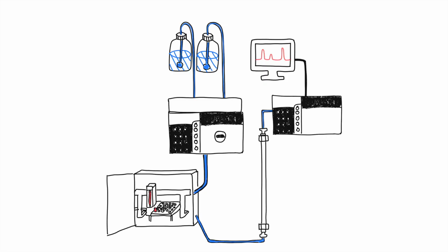The result of the analysis from ion chromatography is called chromatogram. The chromatogram will have an absorbance on the y-axis and retention time on the x-axis. IC cannot identify unknown sample or compound. It can only be used to find an unknown concentration of a known sample or compound.